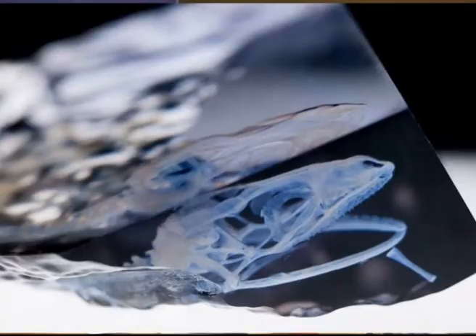Capturing the image which is observed in the microscope onto the photographic film is an important step of photomicrography. This photomicrographic image will be kept in the form of a hard copy. These photographic outcomes are also preserved in the form of a permanent record.